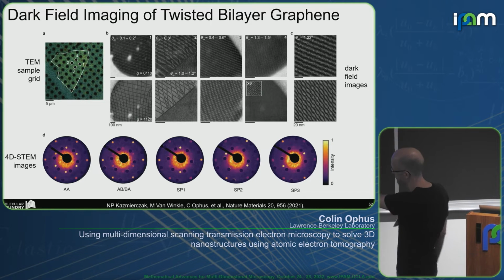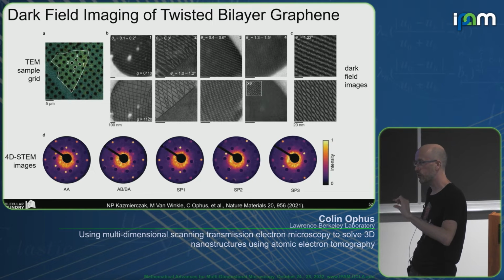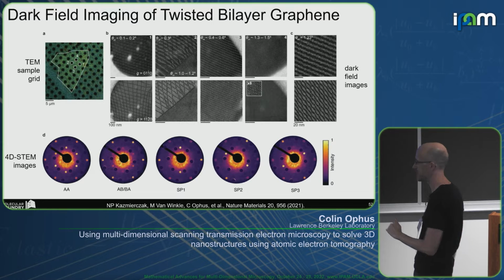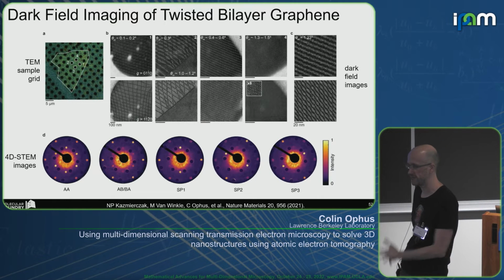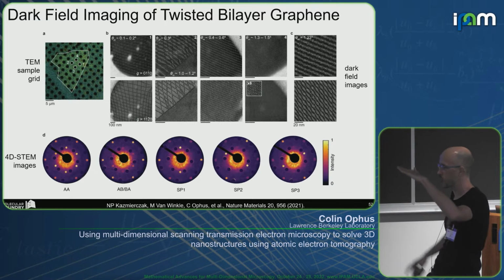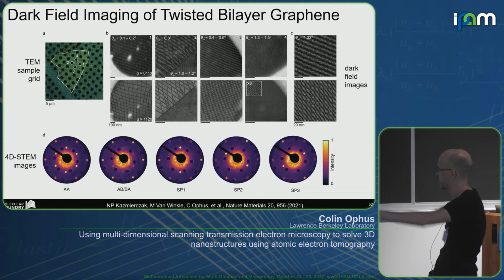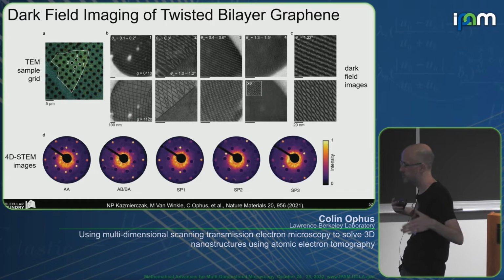And more importantly, what I've masked off in black here, that's the boron nitride substrate. So this is why we're not taking a picture of this in real space. This is on 5 or 10 nanometers of boron nitride as a substrate for the device, right? Those diffraction spots are easy to separate in diffraction space because we simply put the graphene down at a rotation with respect to the boron nitride. In real space, that's all you would see is the boron nitride lattice.